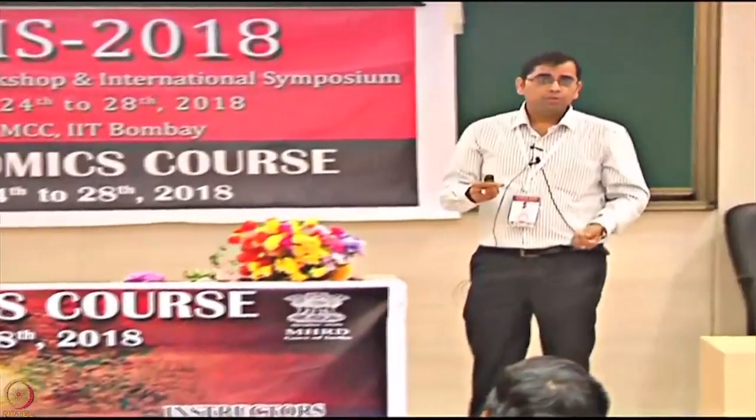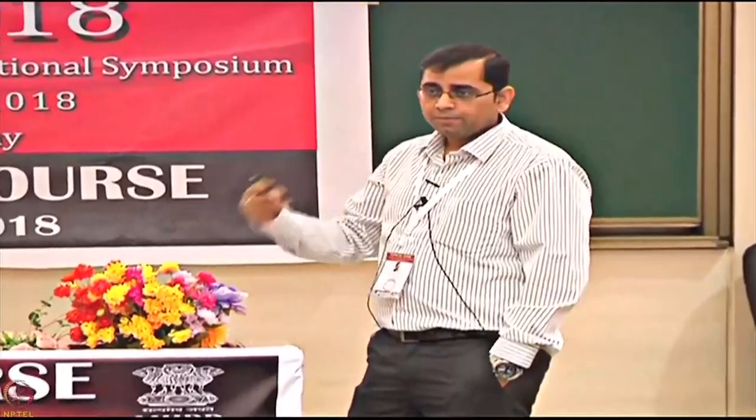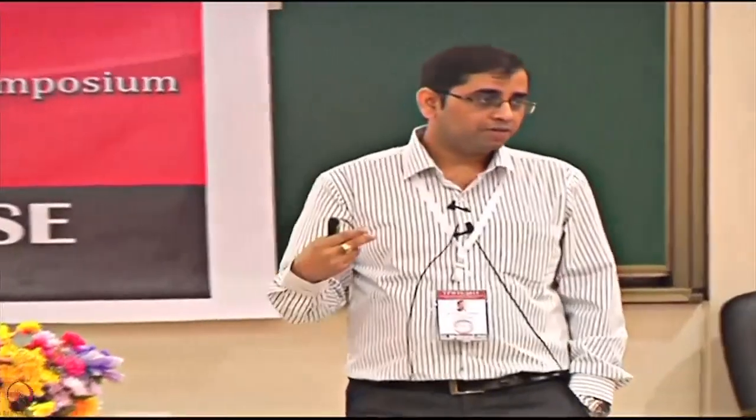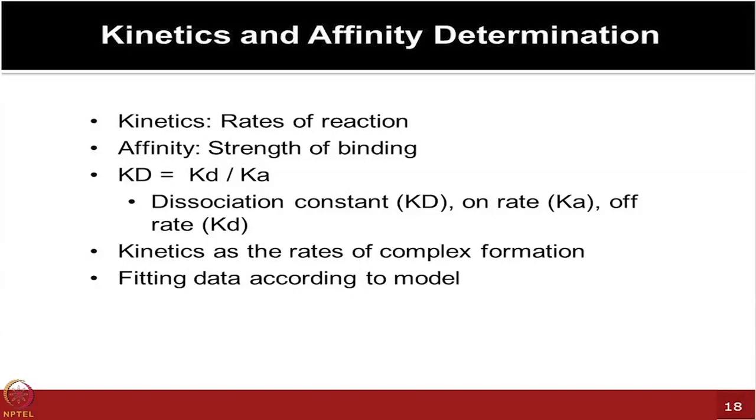Then you wash off with the buffer a couple of rounds, and the same chip can be used again for the next round of interactions. In this way, you can reduce the cost of the experiment. Otherwise, the gold slide and all these chips which we are buying are way too costly. But what it is offering you is much more powerful information.